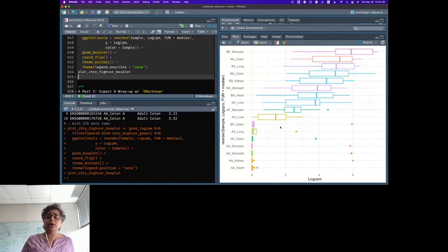Isn't this beautiful? You just got to this based on the data alone, based on your little data sleuthing that you did. And you didn't even have to know. You can just infer this from the data. You don't have to know what the biological sex was, and you can infer it from the expression.